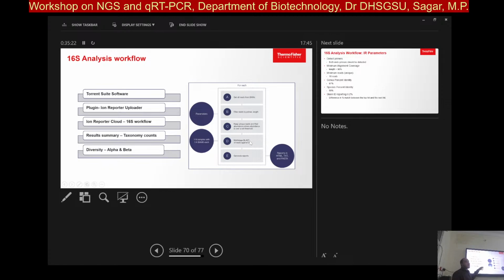Then there's a beta diversity is diversity between the samples. क्यों करना चाहोगे आप? देखना चाहोगे सैंपल्स कितने सिमिलर है. हाउ सिमिलर? उनमें सिमिलर टाइप के स्पीशीज या जीनस या फैमिलीज ग्रो या डेवलप हो रहे हैं. ओके, ये कहाँ हो सकता है? एग्जाम्पल, कैंसर में अगर कोई सी कैंसर स्टडीज कर रहे हो तो पर्टिकुलरली कैंसर के ग्रुपिंग में आपको ऐसे कुछ दिखाई सकता है. या फिर ड्रग थेरेपीज, पर्टिकुलर टाइप के ड्रग थेरेपीज दे रहे हैं, उनमें 16s करो तो पर्टिकुलर टाइप ऑफ पीपल, when I say particular, it's more like metadata, it's more like differentiation कि किस टाइप के पेशेंट्स है, किस टाइप के यूजर्स हैं.